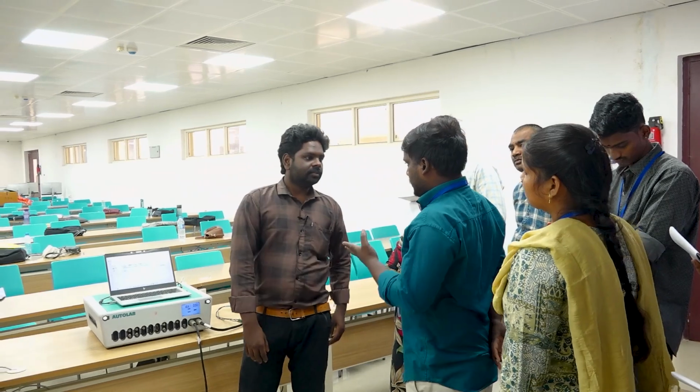Yes, sir. Two types, single layered capacitors and double layered capacitors. And what about single layer capacitors? No single layer capacitor, sir. It's only double layer capacitor. Actually, a capacitor is just like a charge storage. But the double layer happens particularly in the cell. Once you dip your charged material in the electrolyte, ions get attracted to the electrode. So at that time the double layer will form.